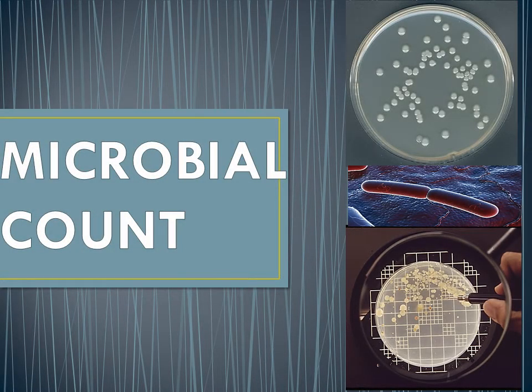In the previous activity, you were able to experience counting cells using a counting chamber known as a hemocytometer. This is just one of the methods used to count cells. We will discuss briefly the four general approaches used for estimating the number of unicellular organisms.